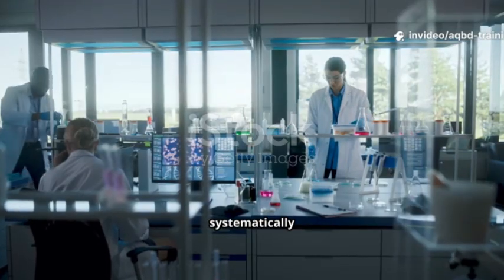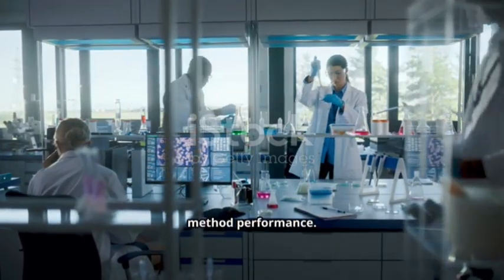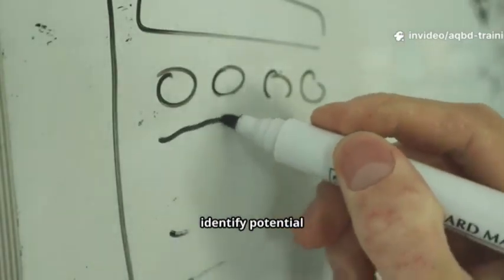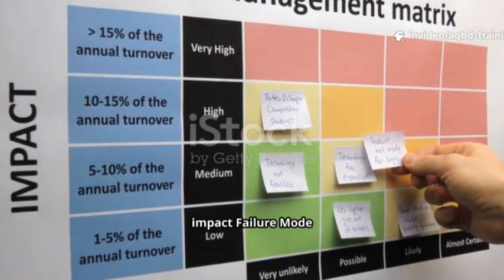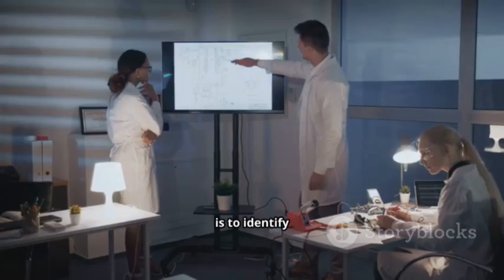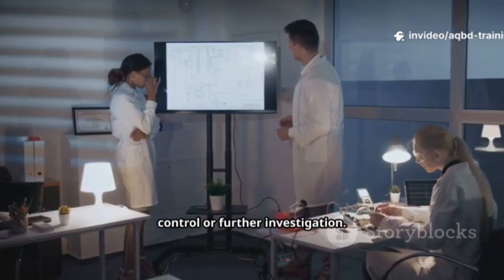Risk assessment systematically identifies potential failure modes and their impact on method performance. We typically use tools like Ishikawa diagrams, fishbone diagrams, to identify potential sources of variability, risk matrices to assess probability and impact, failure mode and effects analysis, FMEA, for comprehensive risk evaluation. The goal is to identify high-risk parameters that require careful control or further investigation.